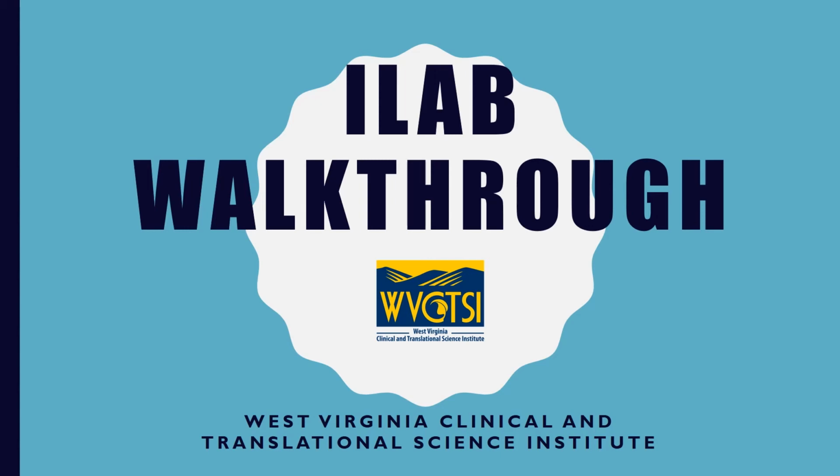I'm the Clinical Services Integration Coordinator for the West Virginia Clinical and Translational Science Institute. I've put together an iLab walkthrough to demonstrate common uses of iLab and useful information for core staff members, managers, and administrators.